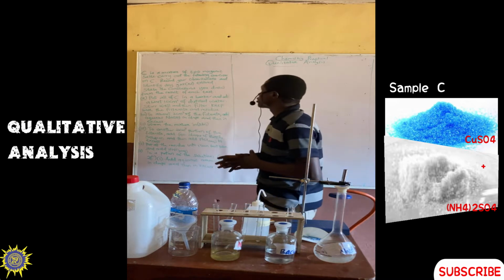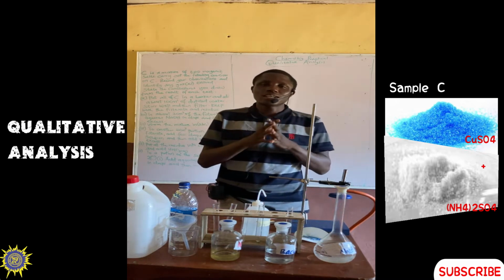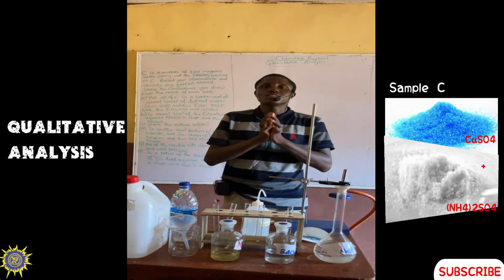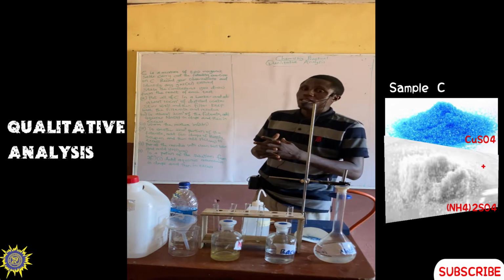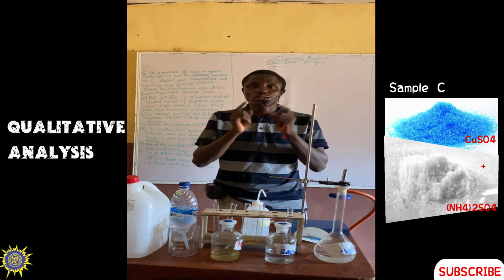Today we are going to be considering the topic called qualitative analysis. Qualitative analysis is a technique used in the laboratory to test for gas, cations, and anions in a given sample. This is one of the questions asked in the chemistry practical exam, especially question number 2.